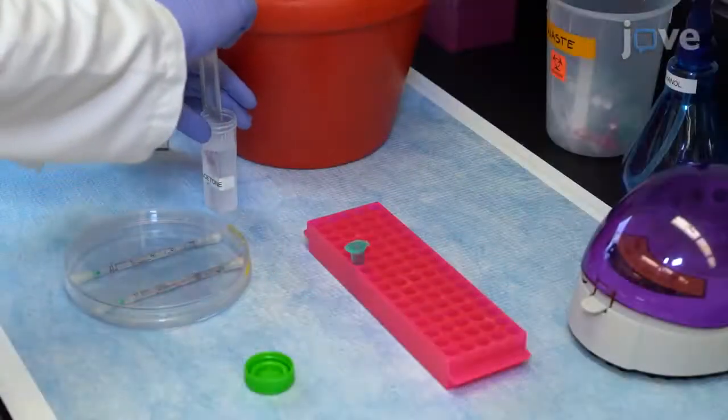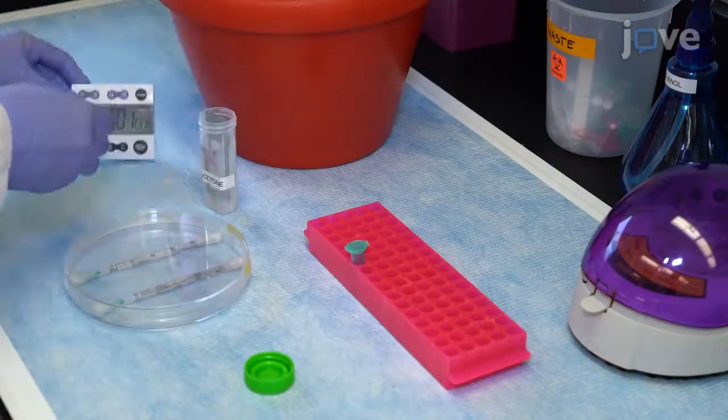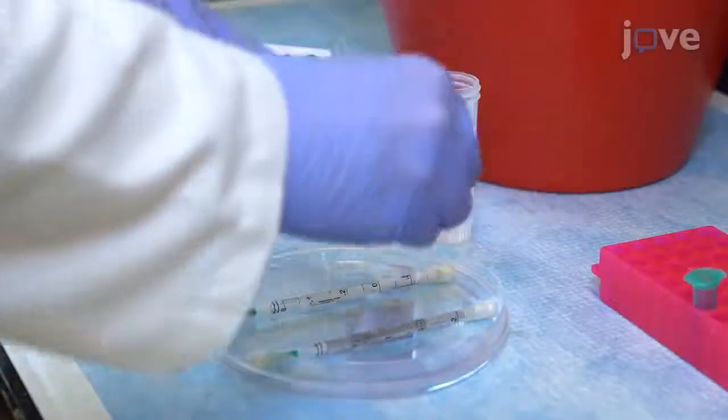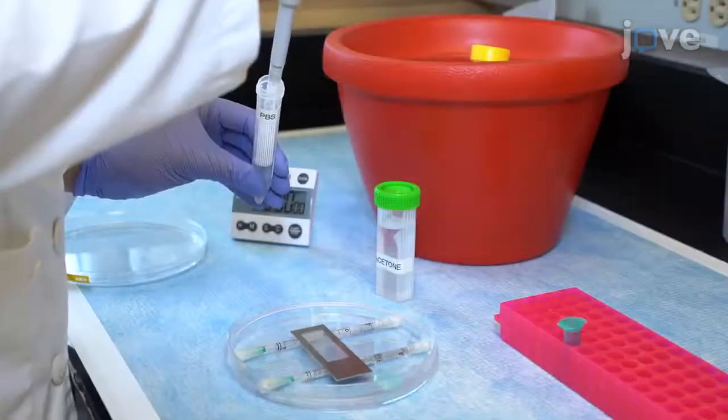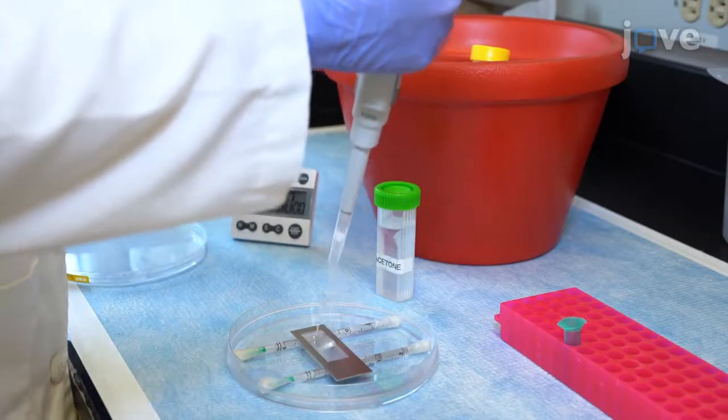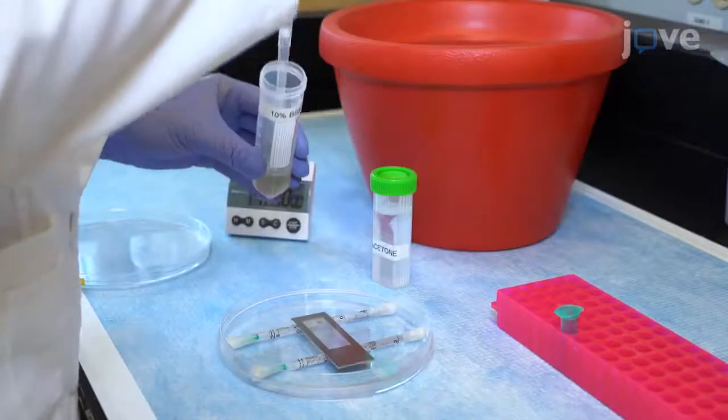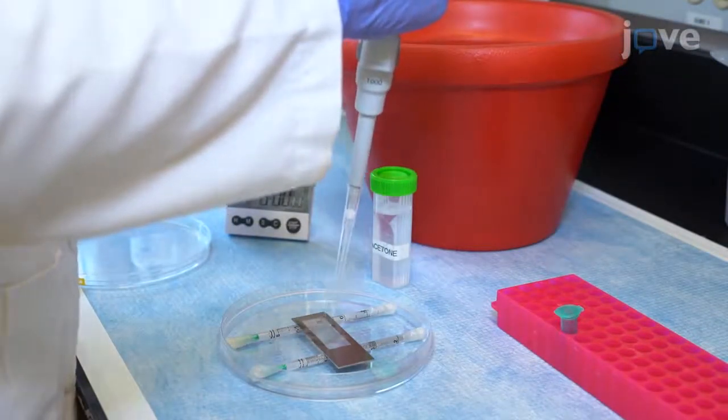Wash the slide in minus 20 degrees Celsius 100% acetone for one minute and place the slide in a humidity chamber. Wash the top of the slide two times with fresh RNase-free PBS for 30 seconds per wash, followed by two 30-second washes with 10% BSA in RNase-free PBS.